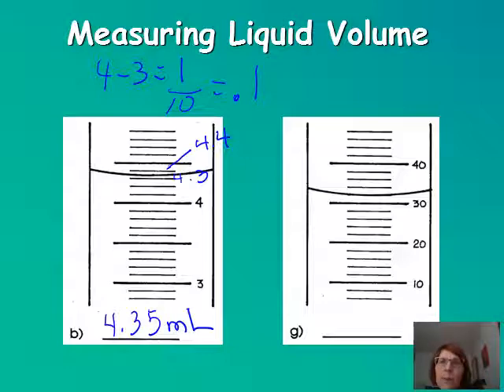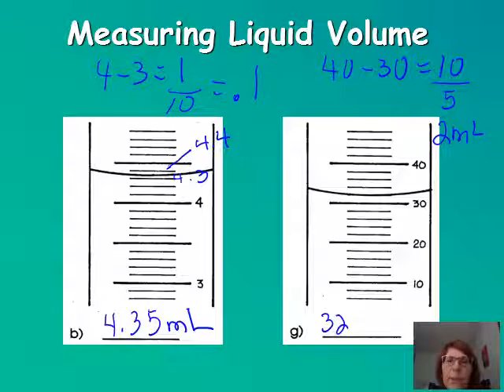All right. So here we have 40 minus 30 equal to 10. So we counted 1, 2, 3, 4, 5, divided by 5. So each of those is 2. So we're going to do 30, 32. So 32.0 milliliters. So you always have to include an uncertain digit when you're doing these.